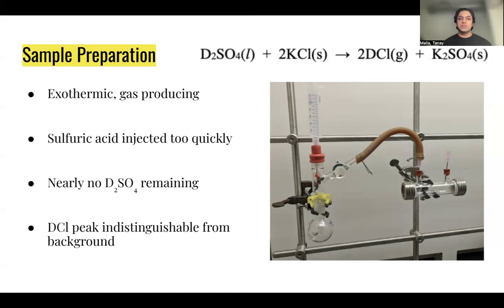This reaction is exothermic and produces gas, so the setup had to be prepared carefully to prevent any gas leak, as hydrogen chloride gas is very toxic.